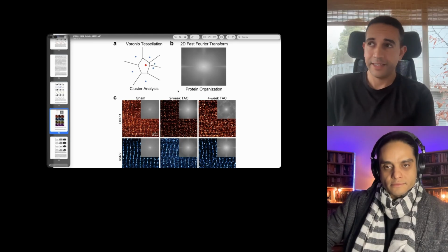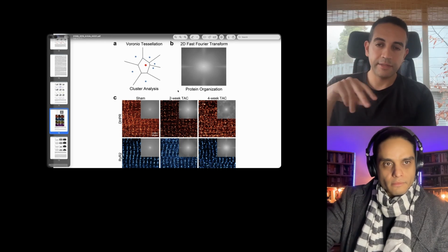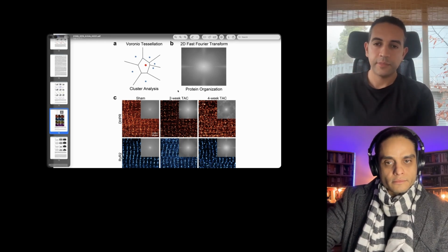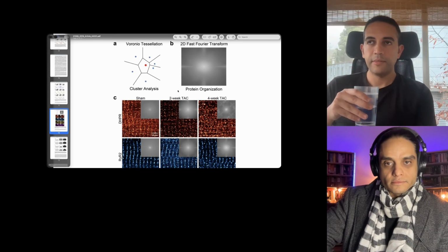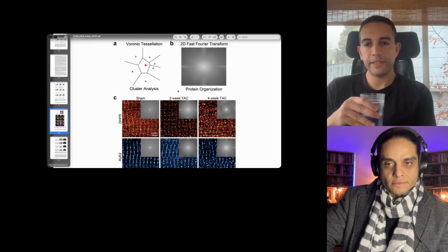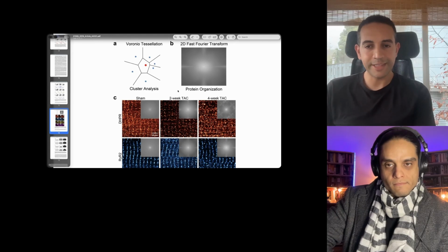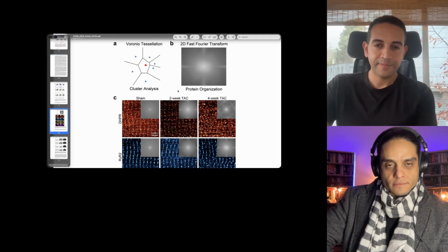There are methods like hyperspectral filtering that allow you to use one excitation and get two emissions out of it, something in the 647 emission, something else in the 670. But those methods rely on things like imaging something in the mitochondria and something else in the nucleus. I know that they're spatially distinct, so you're already deconvoluting them by knowing where they should be.